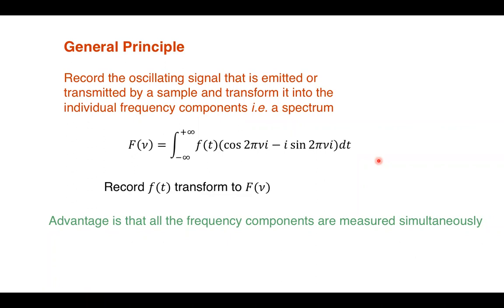And so the power of this is that it's much easier to measure the whole spectrum at one time rather than having to measure it individually. So we record the waveform as a function of time, and then we can transform it into the frequency domain using our Fourier transform.